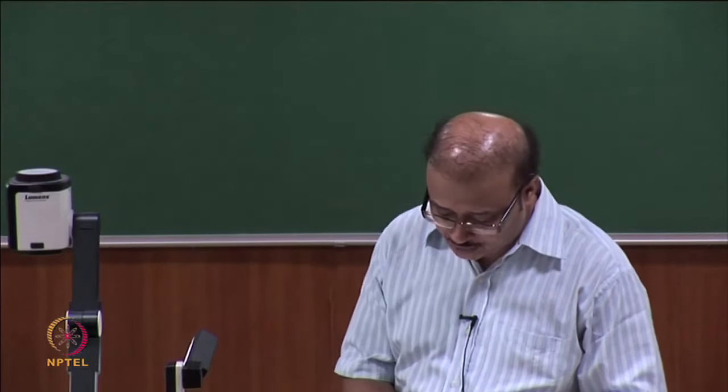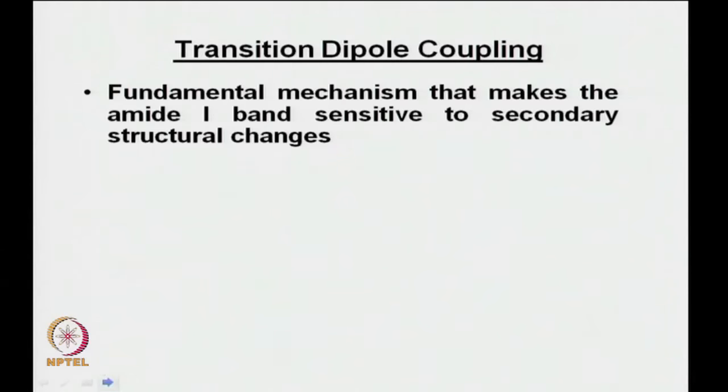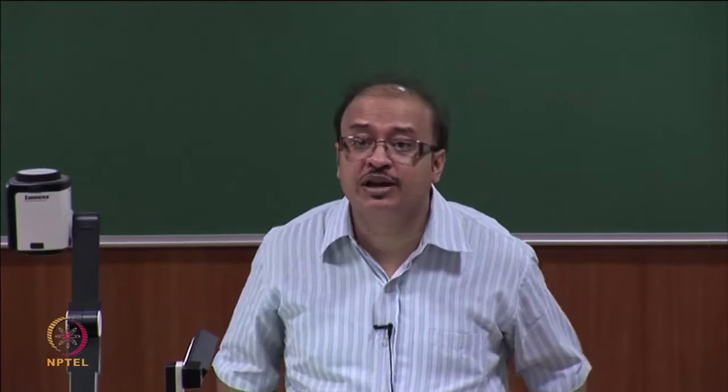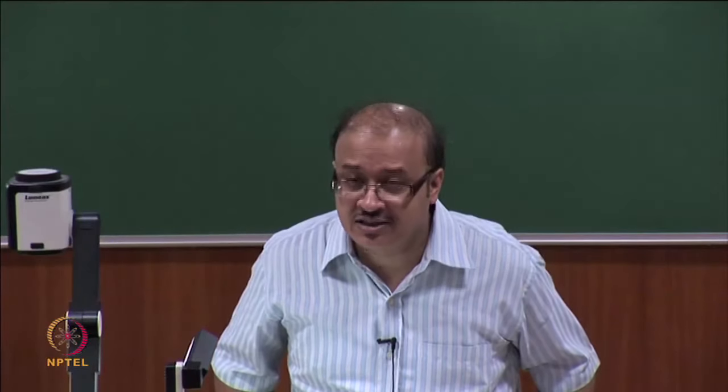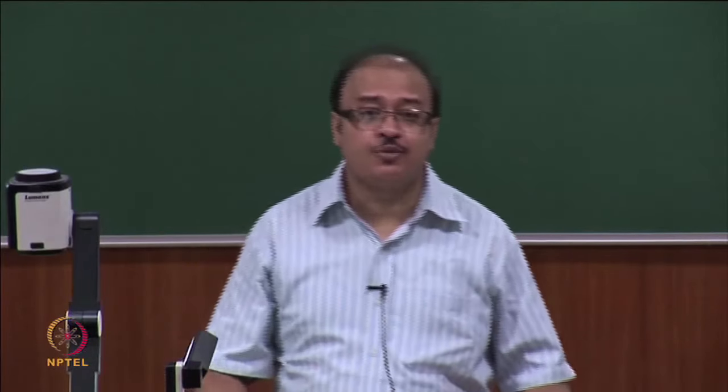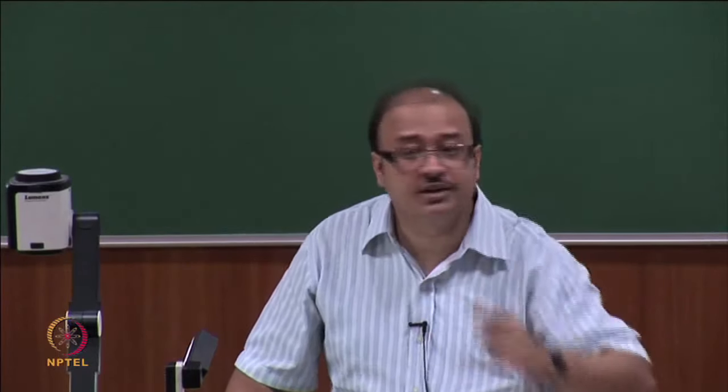So, let us look at this first. The transition dipole coupling is the fundamental mechanism that makes the amide 1 band sensitive to secondary structural changes. So, obviously, you think about these three words, transition dipole coupling. We have already looked at the transition dipole in the previous slide, which was mu, which means once you have a transition dipole, this dipole has to couple with other dipoles.